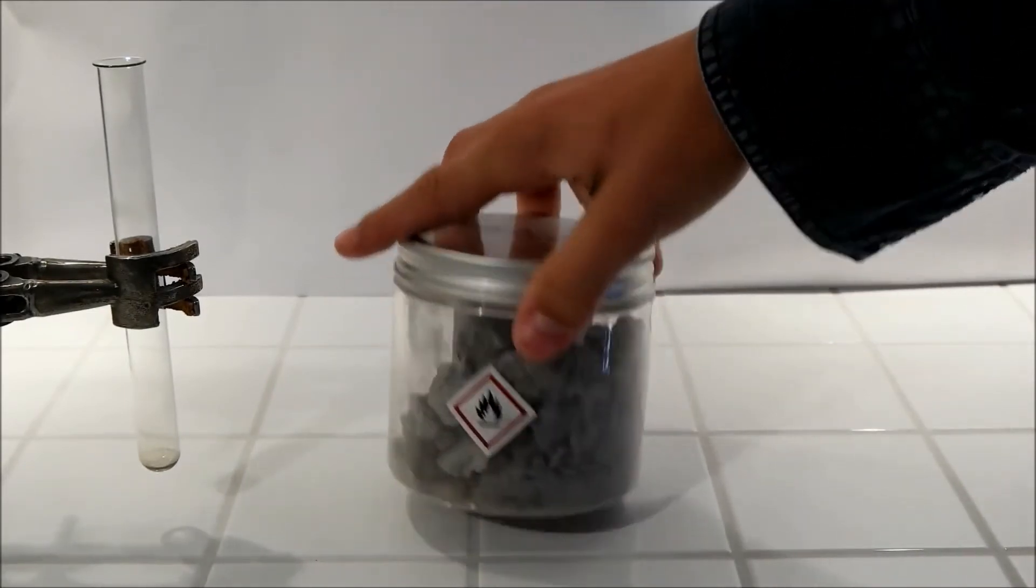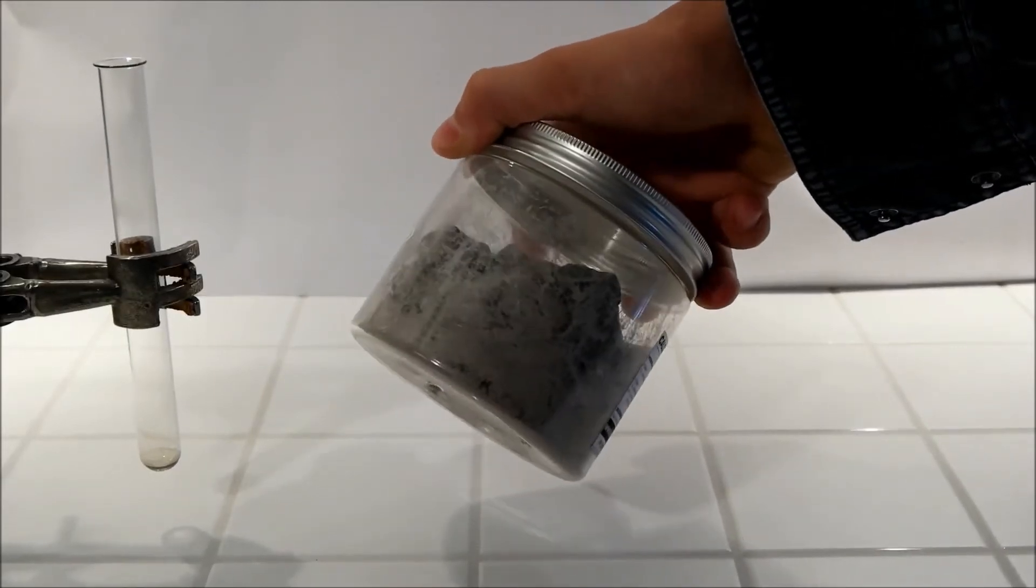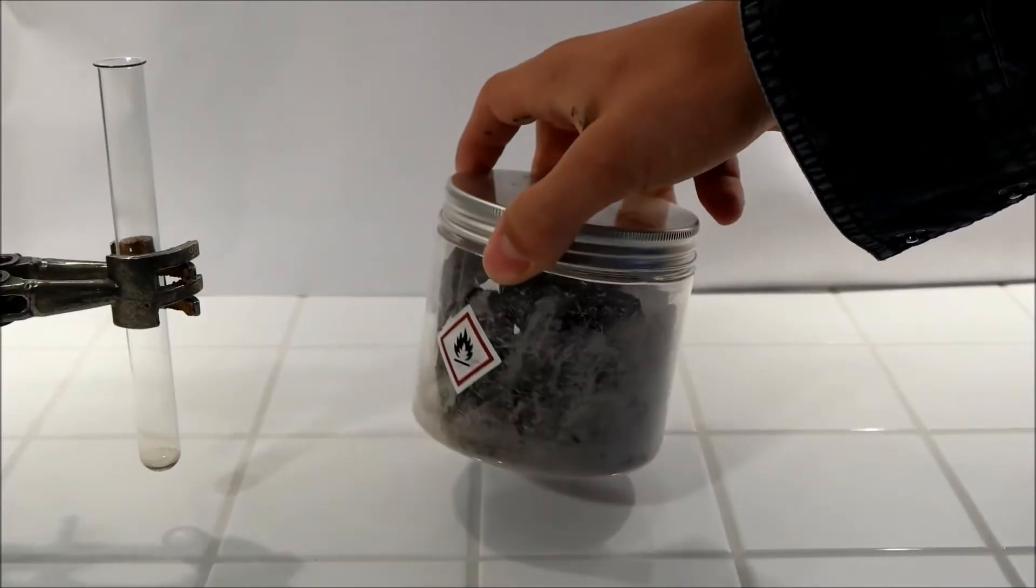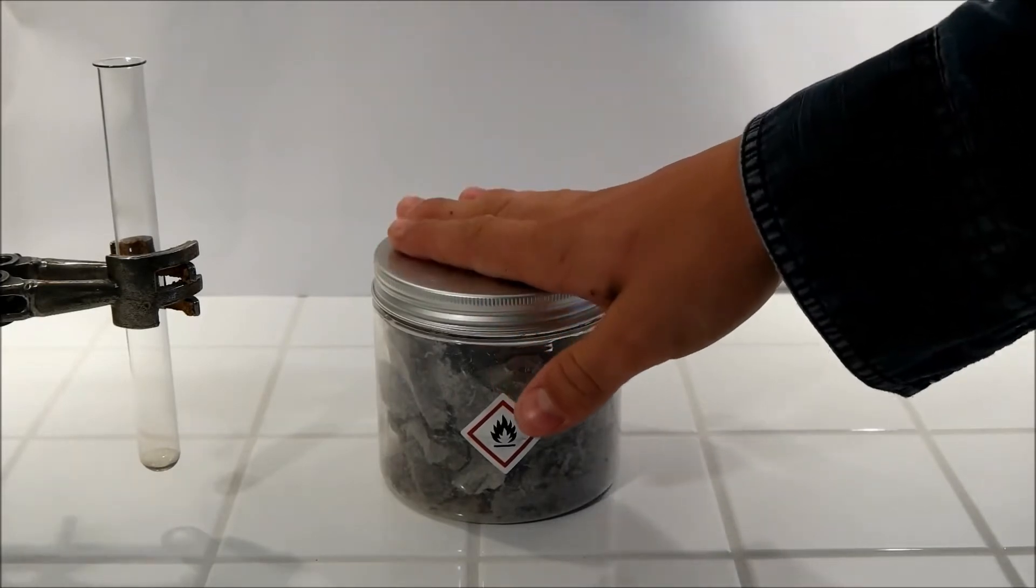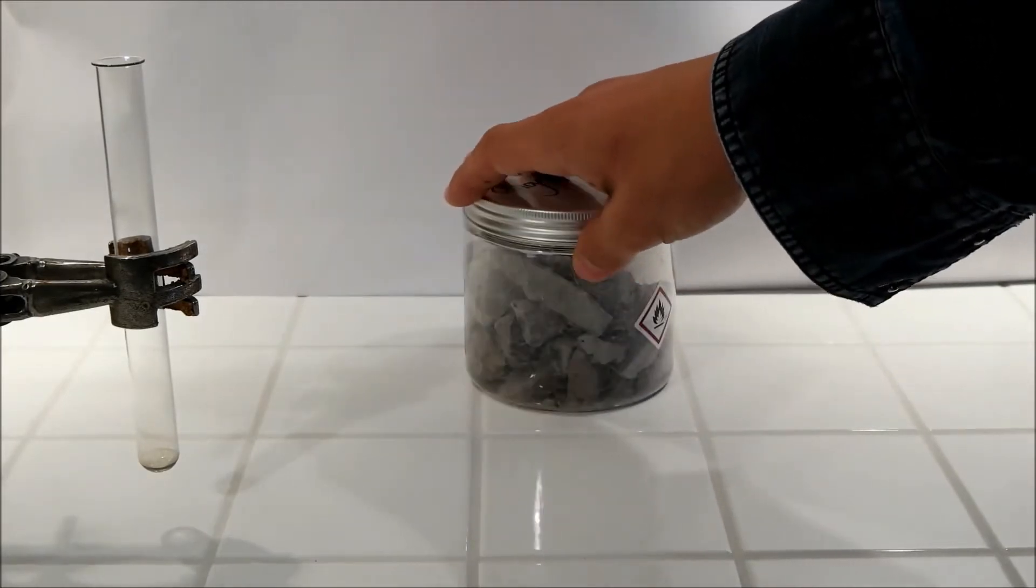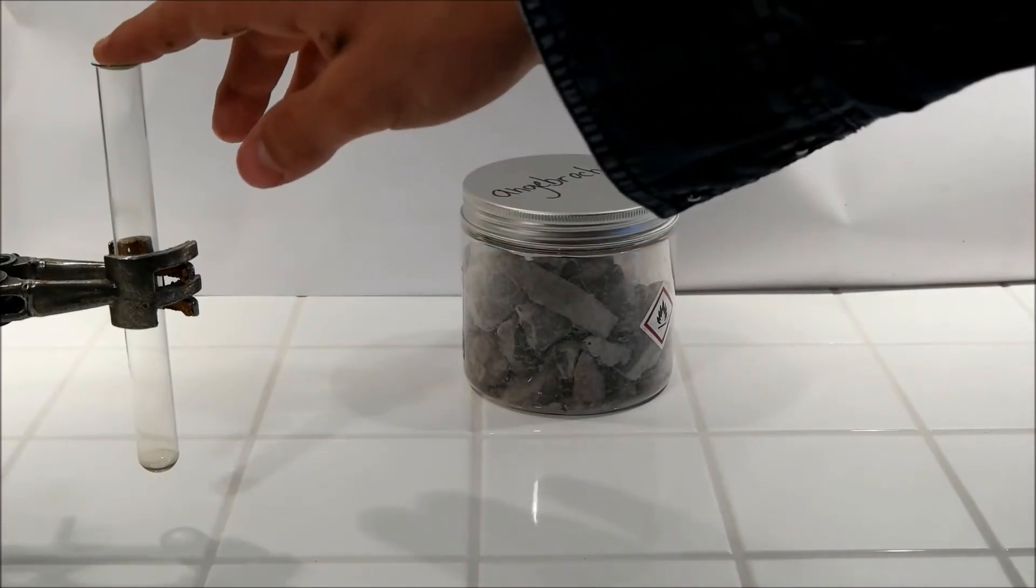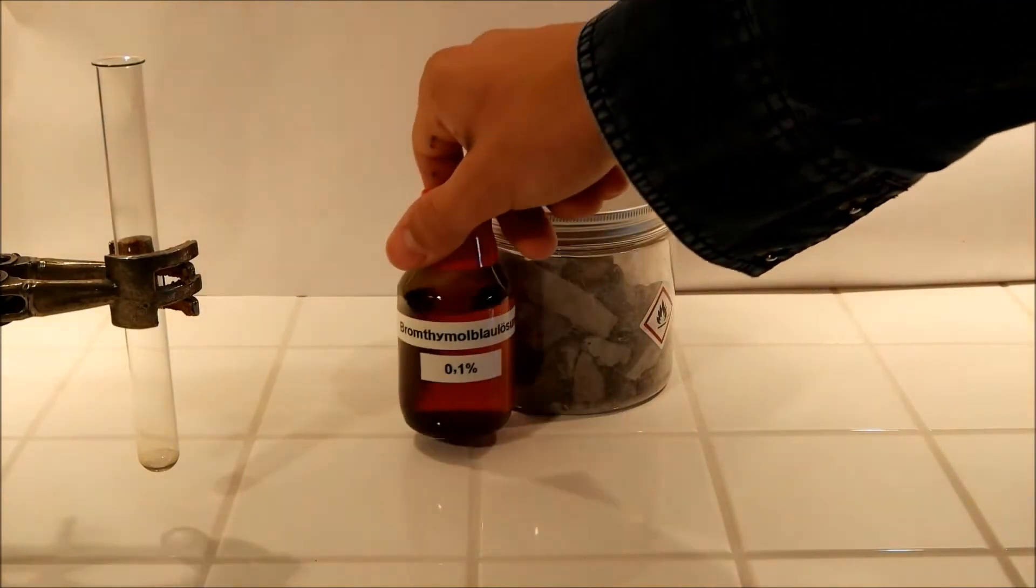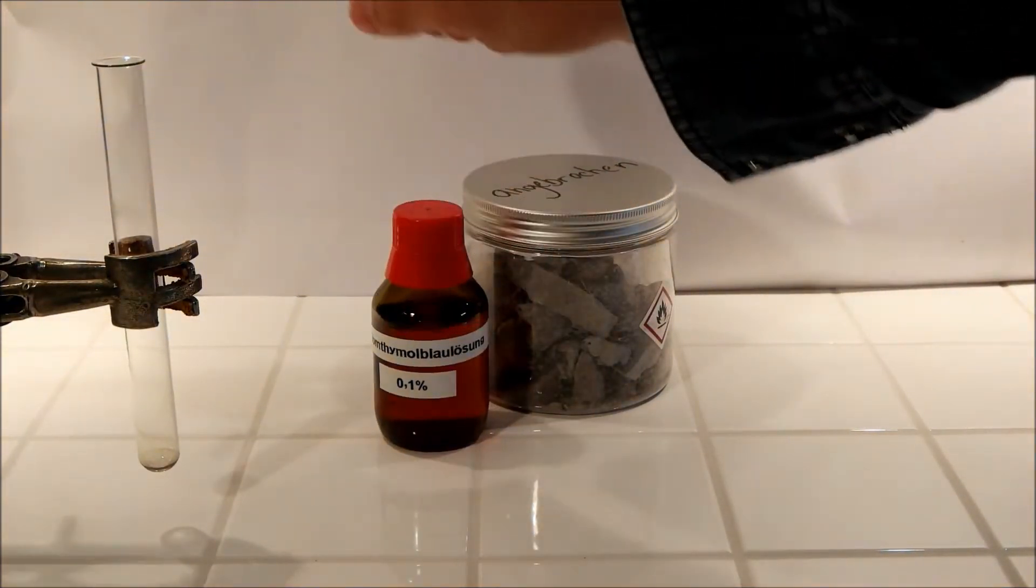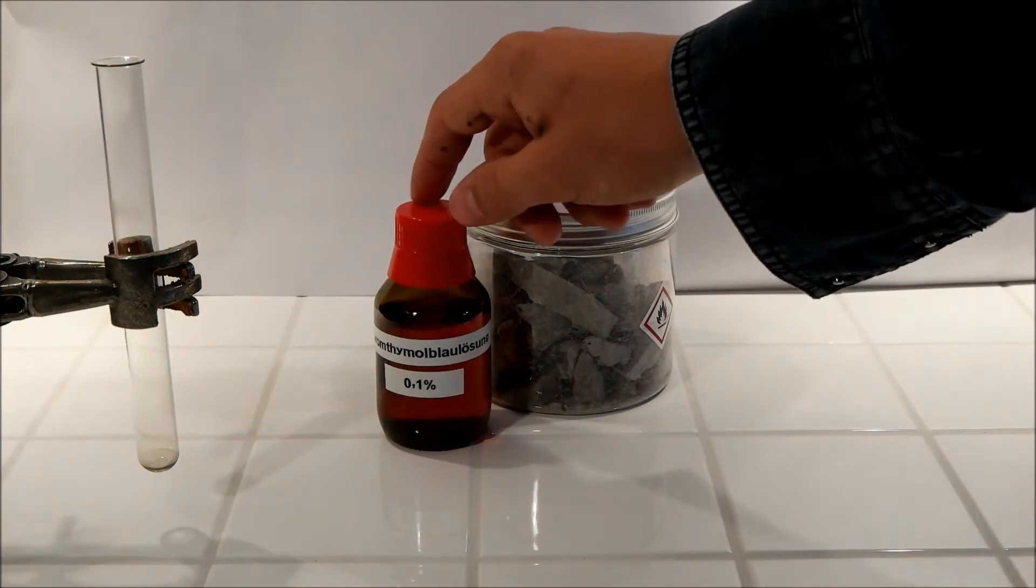So I got this 500 grams for 5 euros and if you put it together with water, there's Ethine but there's also a salt produced which is calcium hydroxide and this is a base of course and our Bromothymol Blue solution will show that it's a base.